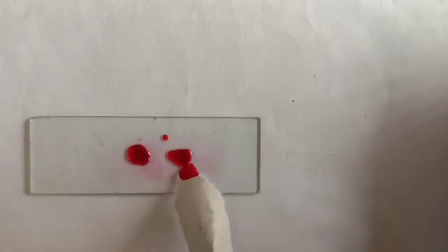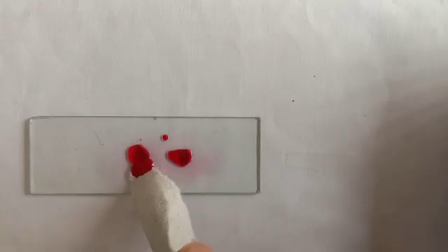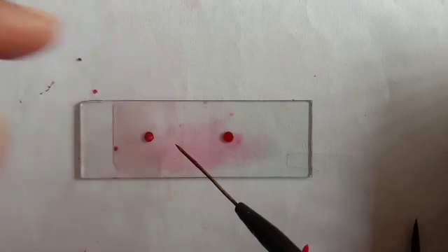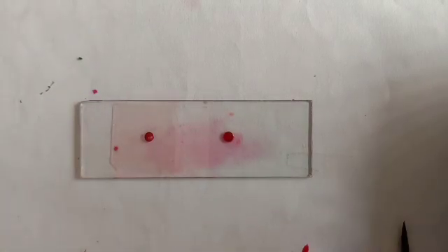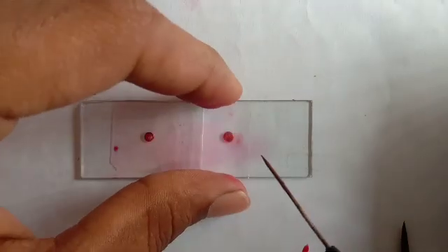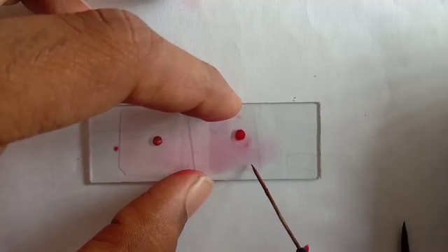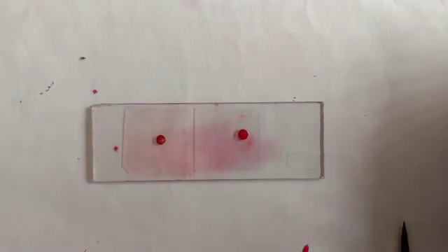You can remove the excess stain with the help of blotting paper. Now we are putting a cover slip over them with the help of a needle. Before adding the cover slip, you can use one to two drops of glycerin also.